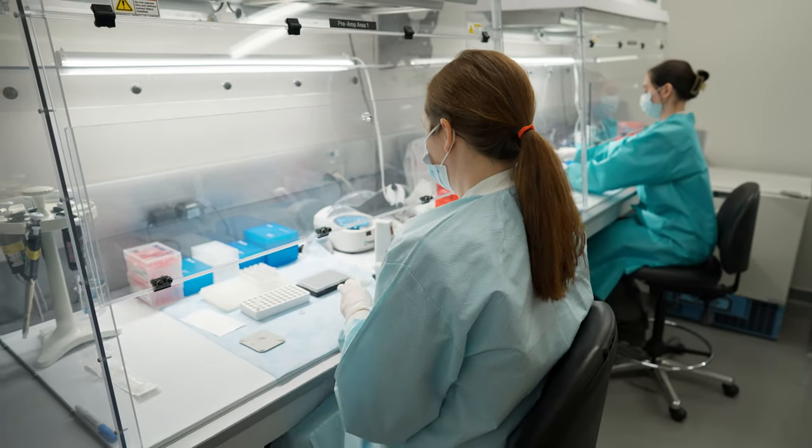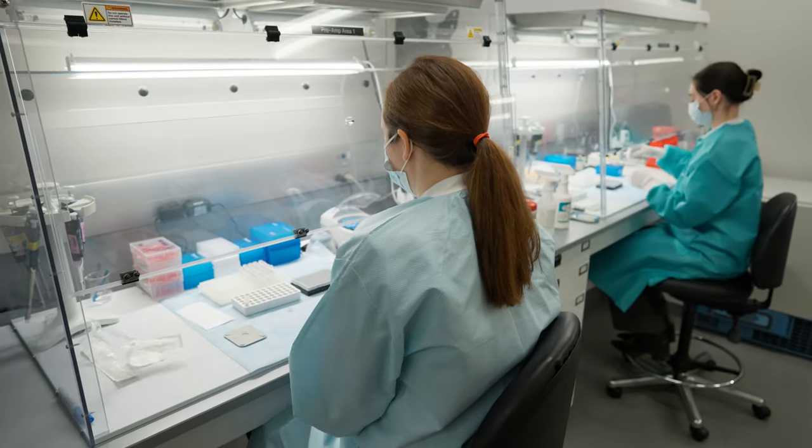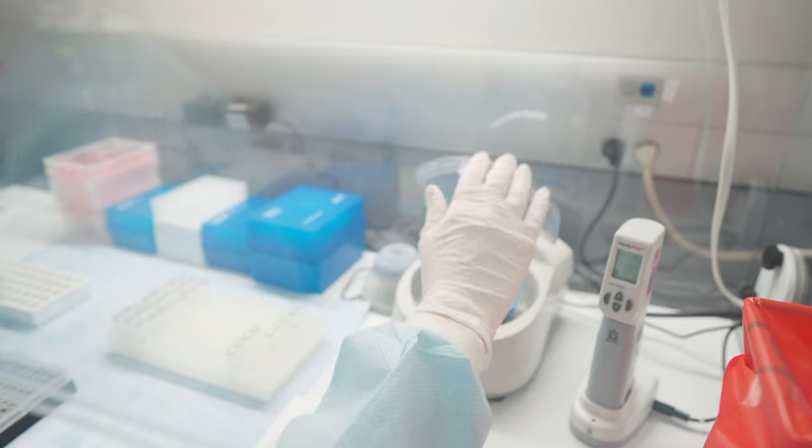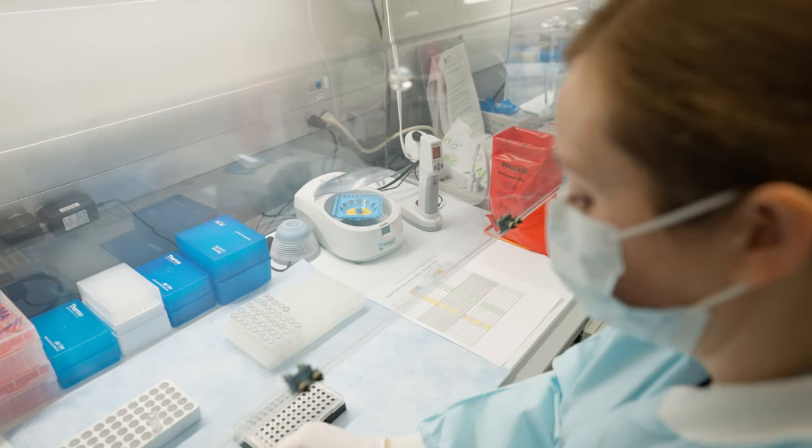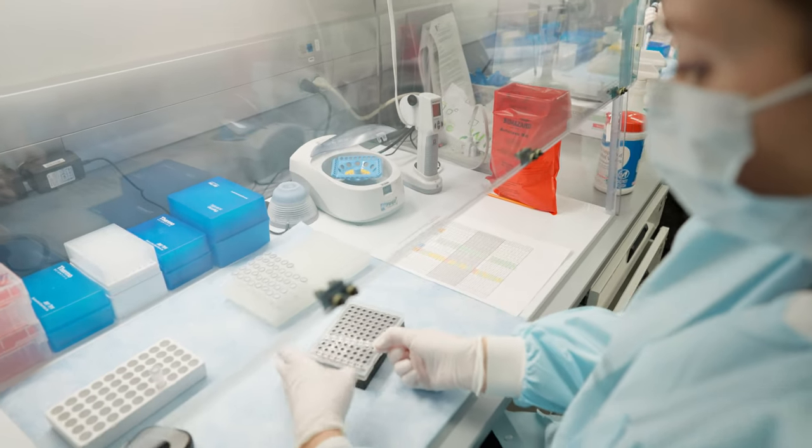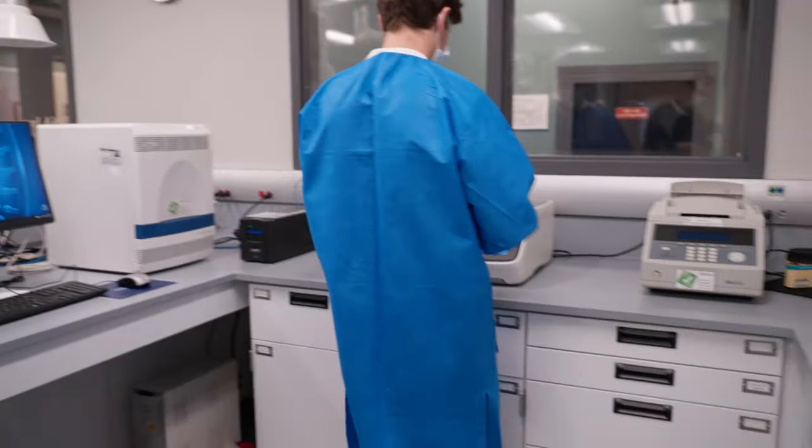During the PCR process, fluorescent tags are added to the DNA fragments as they are being copied. A specific volume of the DNA extract is added to a PCR plate containing the amplification reagents. The volume of DNA extract used depends upon the quantitation results.